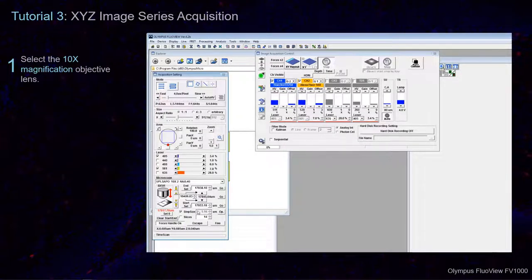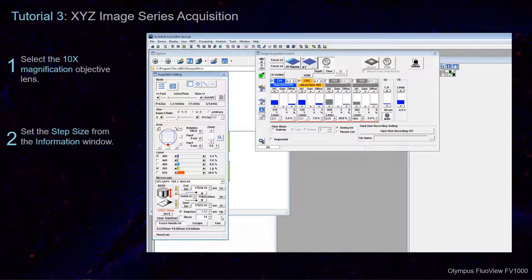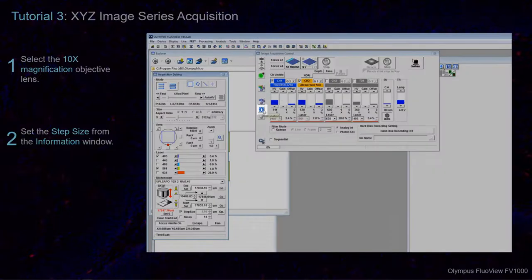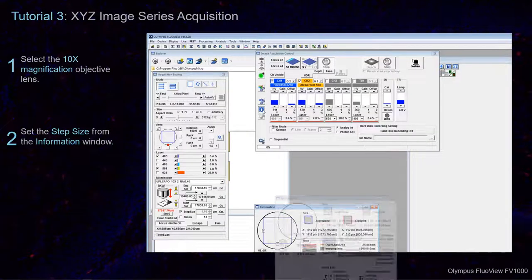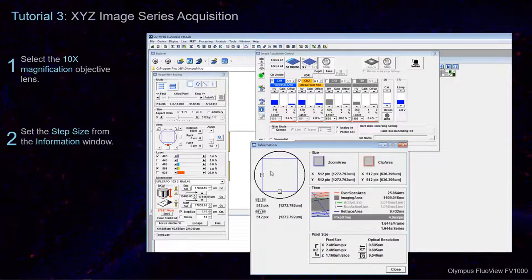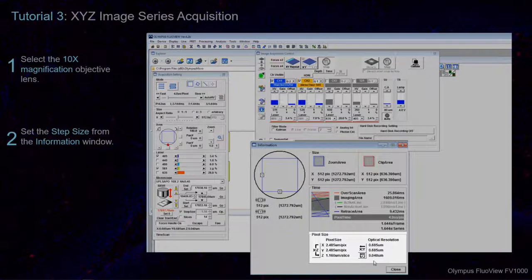Next, we want to set the Step Size. Open the Information window from the button on the side of the Image Acquisition Control window. In the section named Pixel Size, click the Half button.